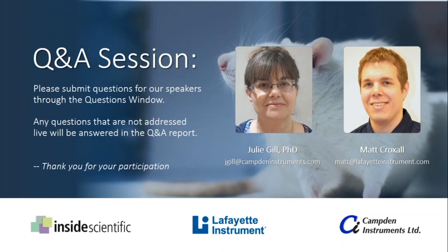There's a very thin bezel right above the glass of the monitor, which contains all these beams. That's a very important cleaning area that needs to be kept very, very clean. But really, we only see the bottom bezel area get a lot of dust and dander while running these chambers.